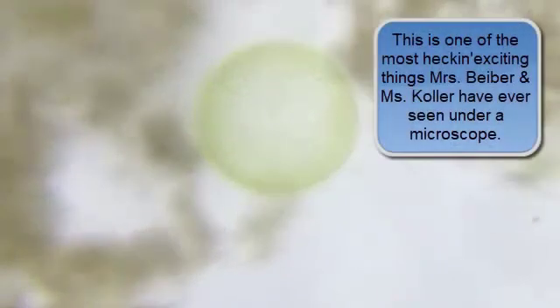We've got a volvox. That big green circle is called a volvox, and it's actually one of the colonial protozoans that live in a colony. There's a whole bunch of little cells inside of it. Each one of those green dots that you're seeing is an individual cell.